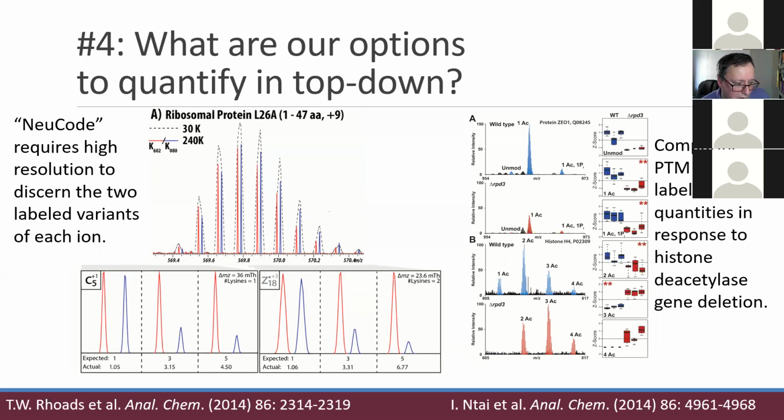Let's see. So Duncan asks, how efficient is ionization when performing top-down? The complexity of the eluting sample is not known. Gosh, I would say that this is a point of some difficulty. I would say that if you don't know the complexity of the eluting sample, you're almost surely going to need fractionation to deal with that complexity.